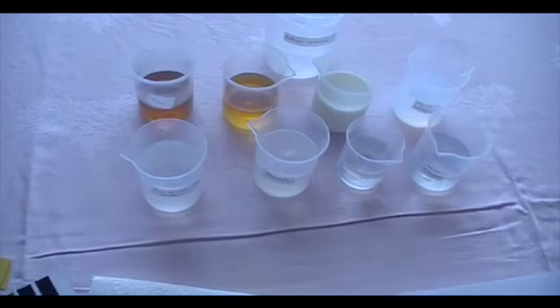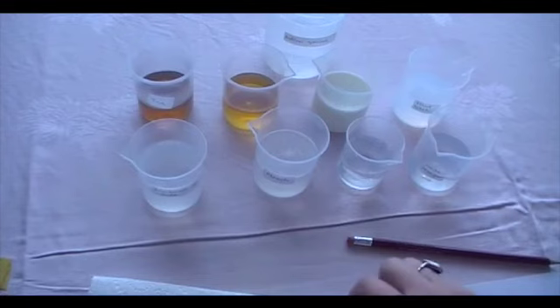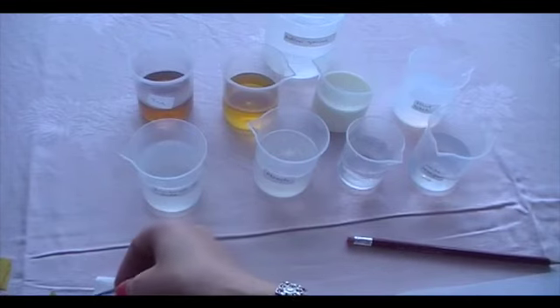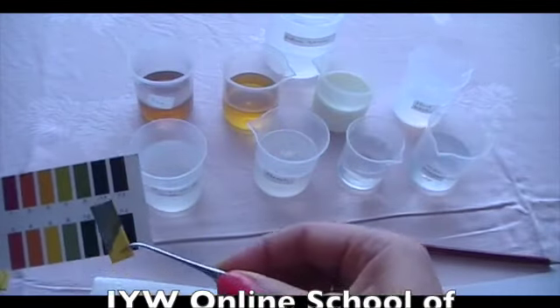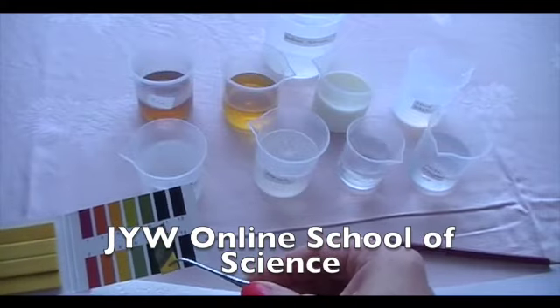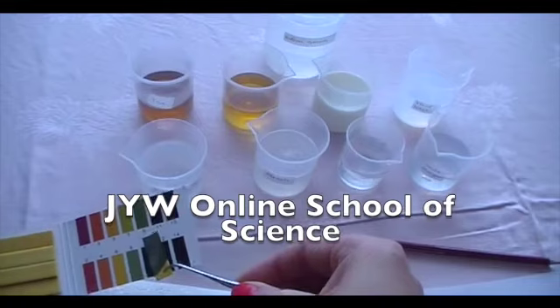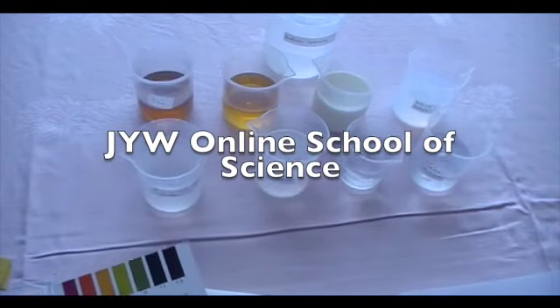Okay, bleach, pH 12. And next one, let's see, bicarbonate of soda. And that one looks like pH 9. Okay, that's pH 9.